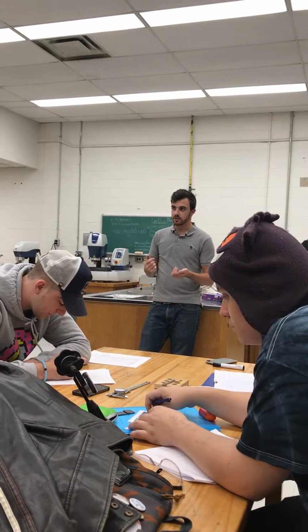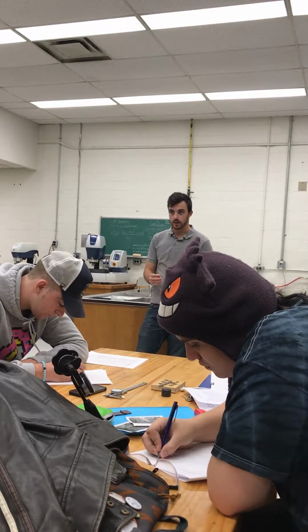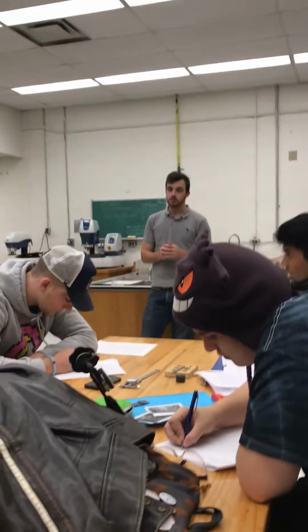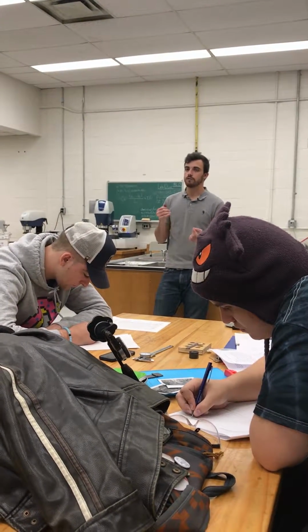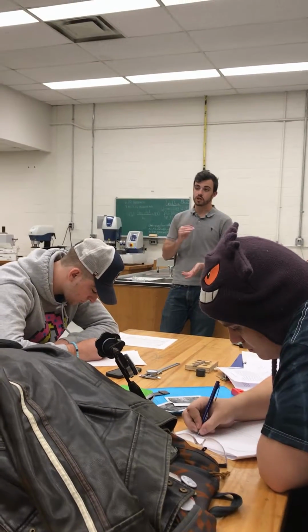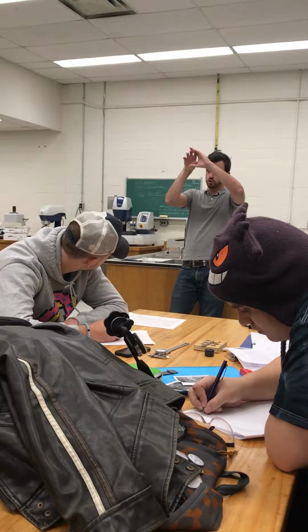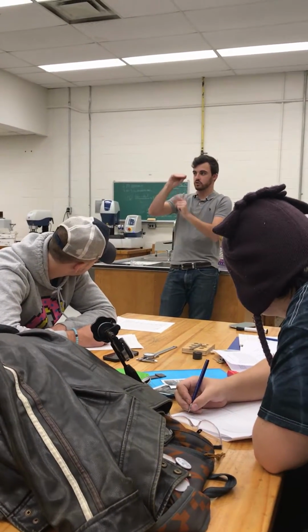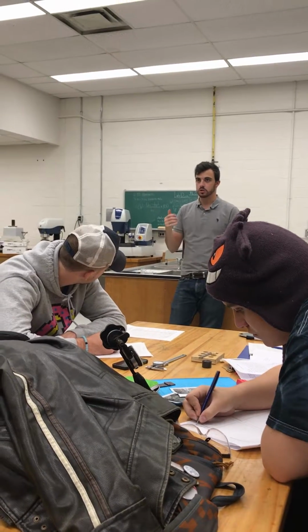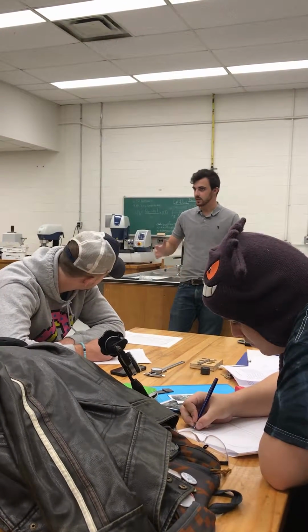This is done so that I understand that you understand what a compressed grain versus an equiaxed grain looks like. I then want you to draw arrows indicating the direction of force applied for the compression of the grains. So the grain was initially like this, and then it was squished like this. I want you to show arrows saying that it was pushed in this direction, such that I know you understand what direction it was compressed in. Does that make sense?